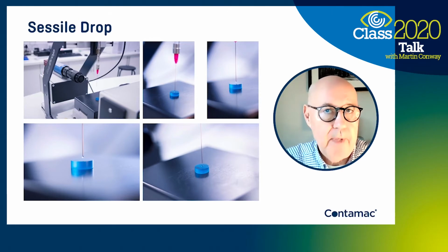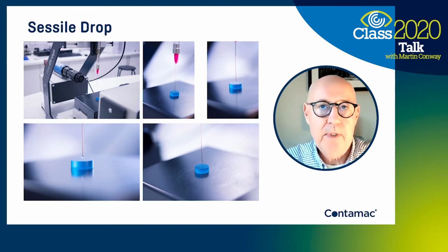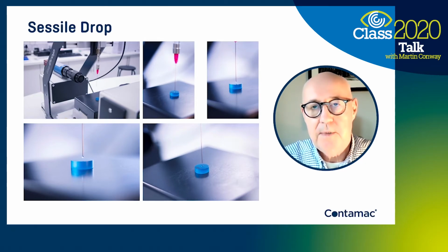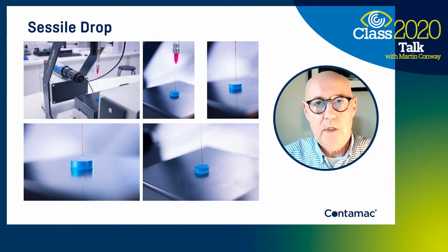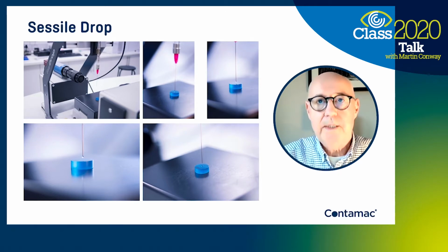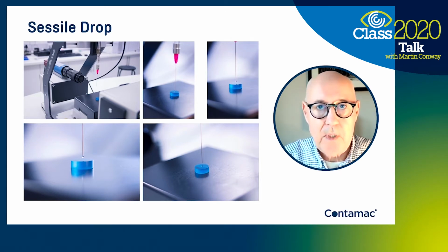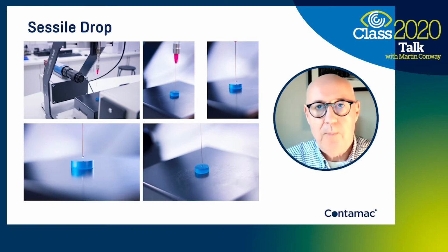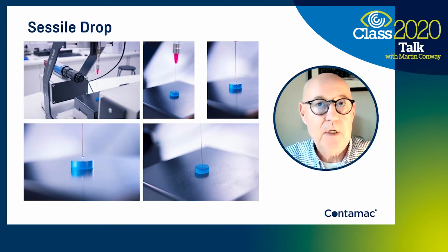The sessile drop method involves placing a measured droplet of water onto the polished surface of the material to be measured. The more resistant the material is to the flow of water across the surface, the more weight of water it will suspend above it. And we measure the angle at which the droplet makes with the contact surface of the material, and that determines the contact angle, as the name suggests. The higher the angle, the less wettable the material.